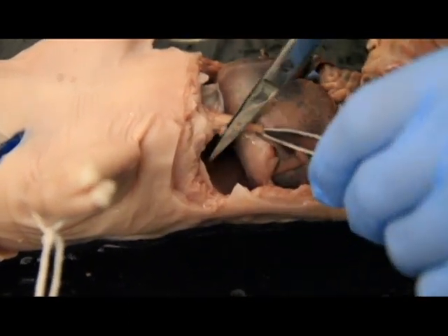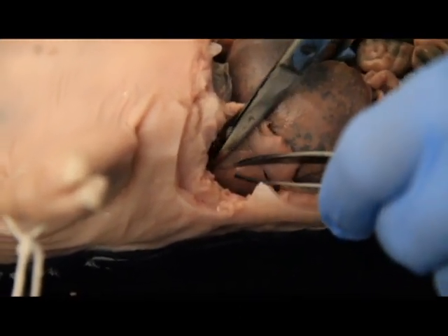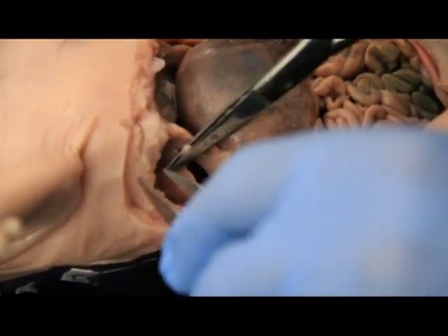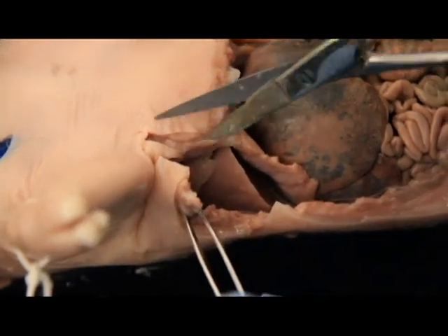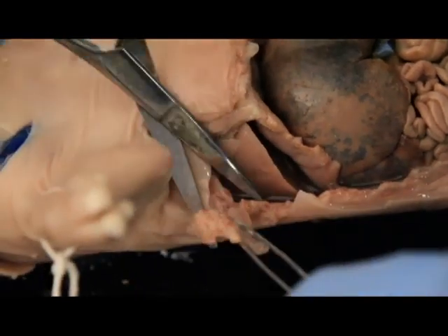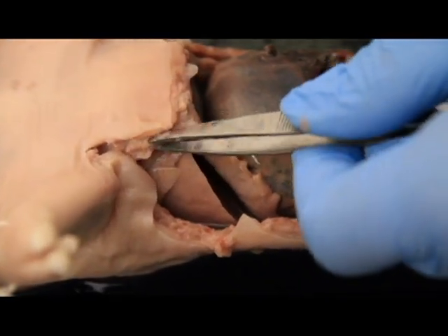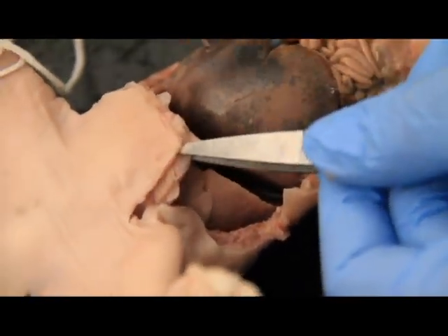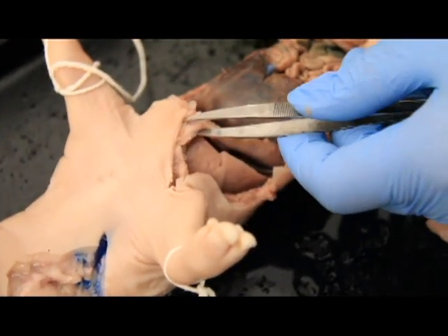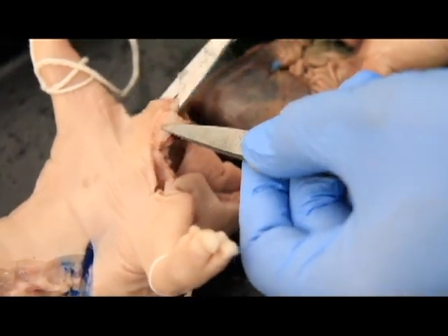Again, this outer layer membrane is the diaphragm. So now I've cut in on the side over here, and this is my lung. This is one of the lobes of my lung. And just like the body cavity, you can see how it's not really attached. We can almost look right in there, and nothing is actually attached. So once you get into the chest cavity, then you can start making these larger incisions without hurting anything. So now you can peel all this back, again breaking these tiny little ribs, and you can lift this up and say, oh, okay, I'm not really going to hurt anything. And it's key to always lift up and look in when you're cutting. So I can lift up and look in here and see, oh, okay, there's nothing really there, I'm not going to hurt anything. And you can start making those incisions.